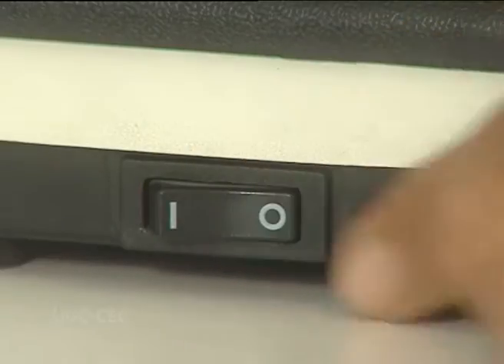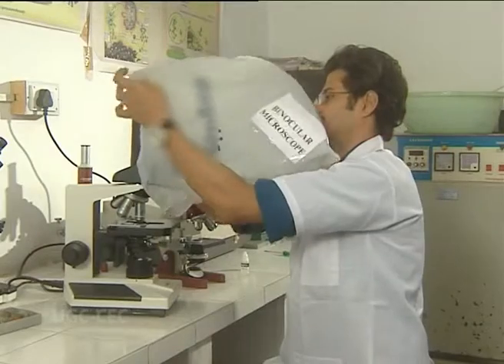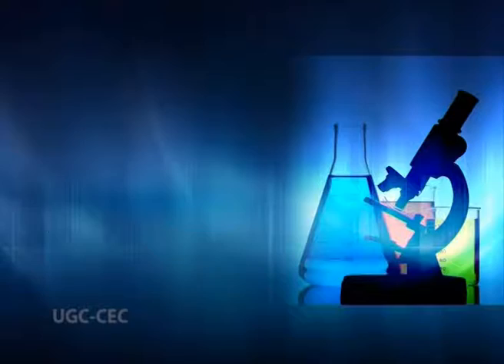If immersion oil was used, wipe it from the objective with lens paper or muslin cloth at the end of each session of use. In general, avoid wiping the objective except when it seems to be dirty. Turn off the light. Cover the microscope when not in use and take necessary precautions against fungus.